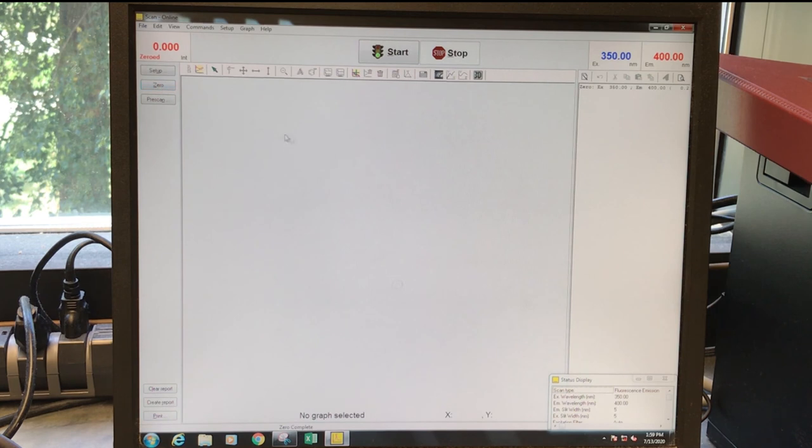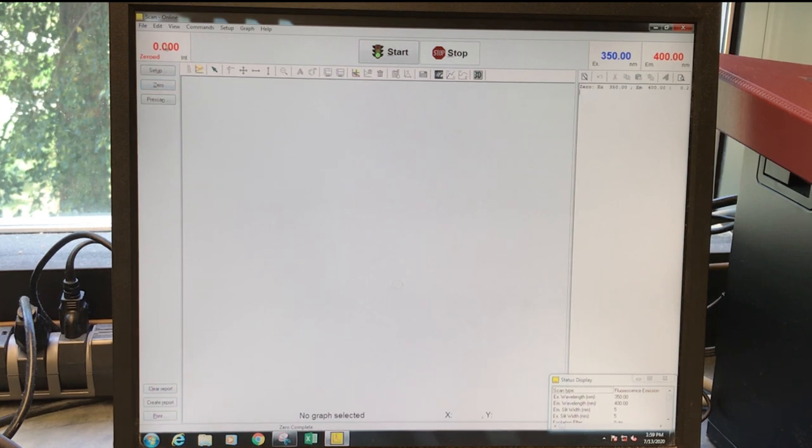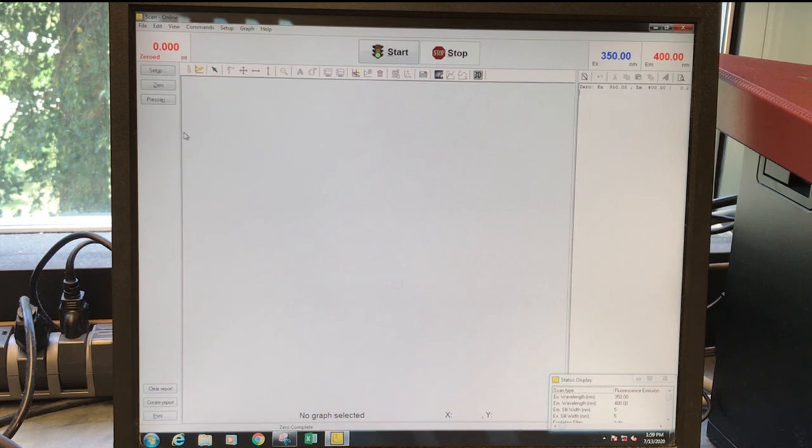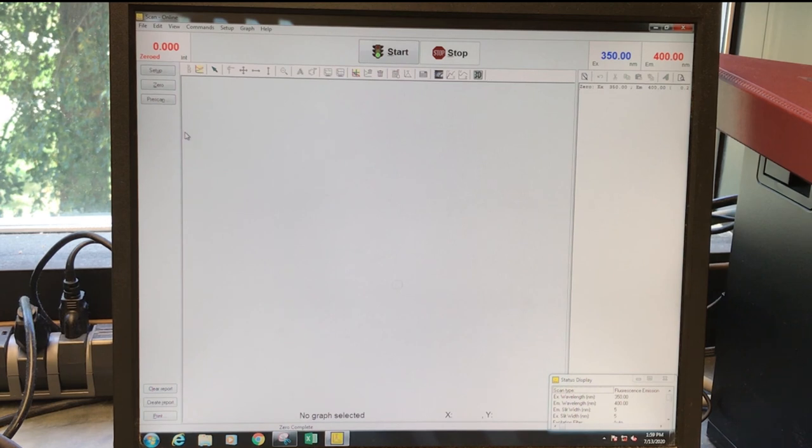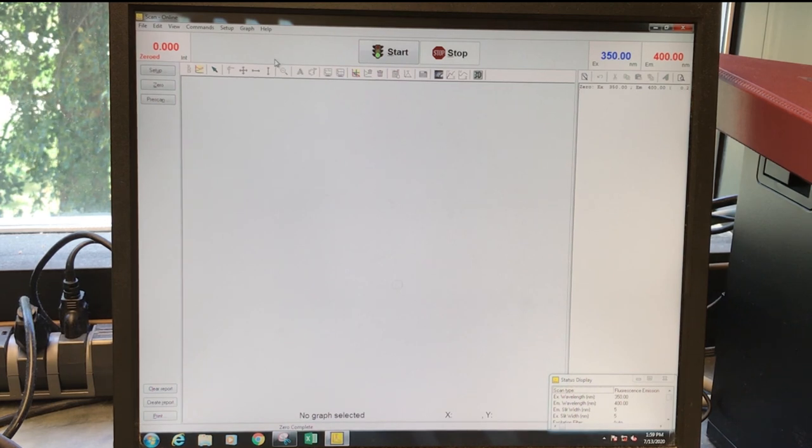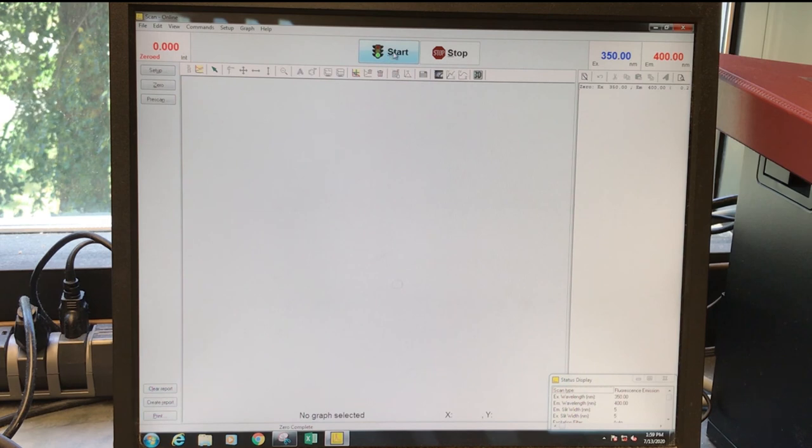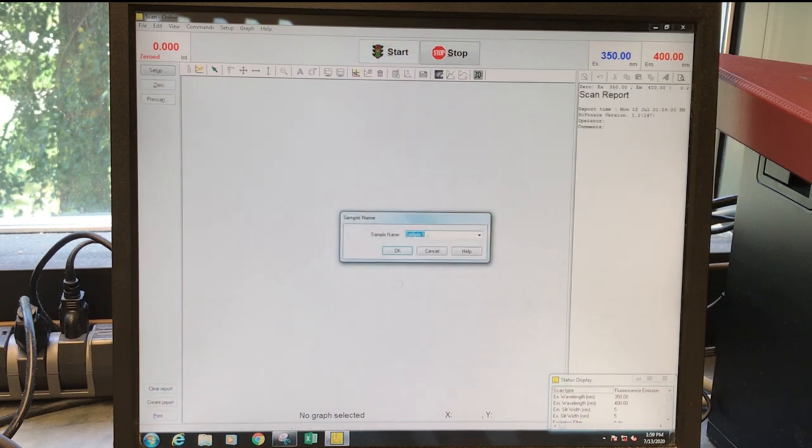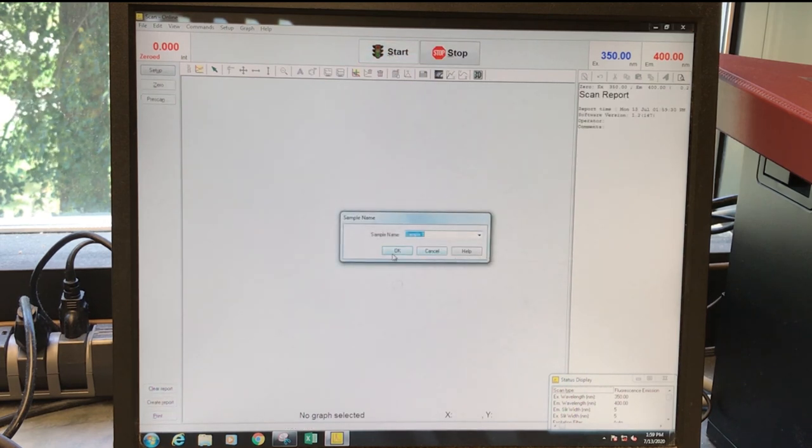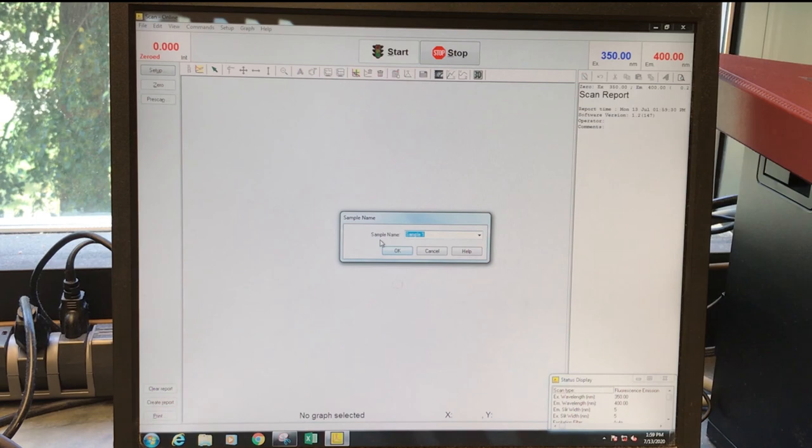You can zero out the instrument when there's nothing in there. So we'll have a zero here. You should always collect a background spectrum if you're going to be doing quantitative work. That background spectrum is going to be the solvent that you're using. And to run a sample, you'll click start. It'll ask you for a sample name. You click OK and it'll run.